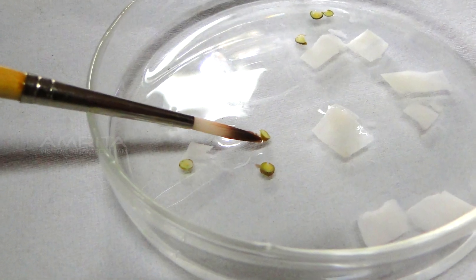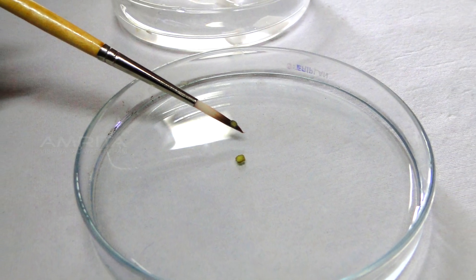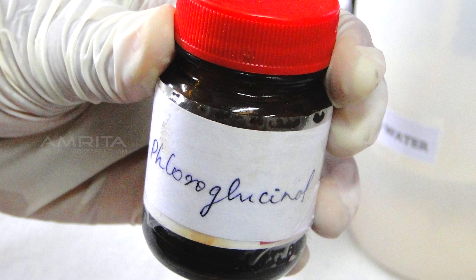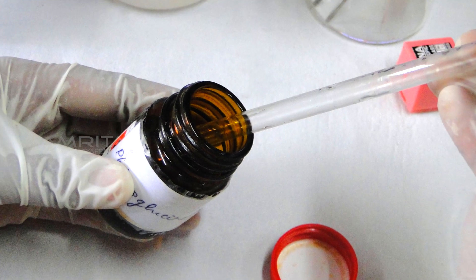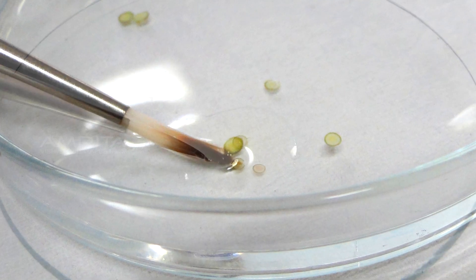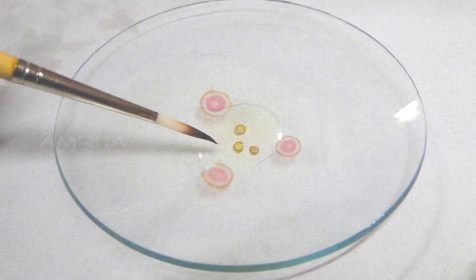Using a brush, transfer the cut sections of the stem into a petri dish containing water. Pour a few drops of phloroglucinol HCL stain into a watch glass using a dropper. Transfer the cut sections of the stem from the petri dish into the watch glass using a brush.